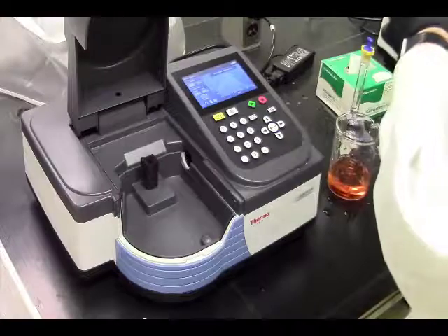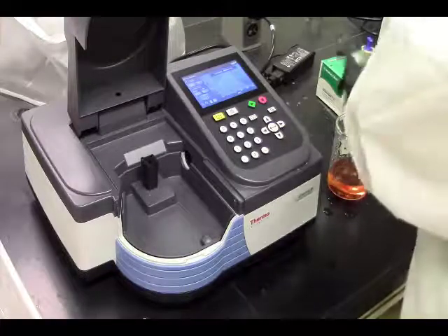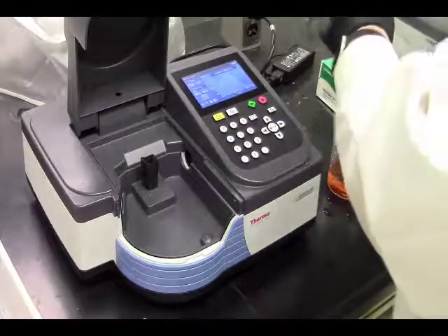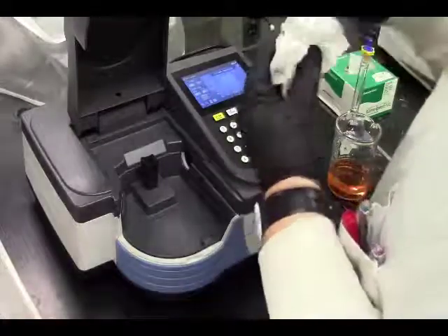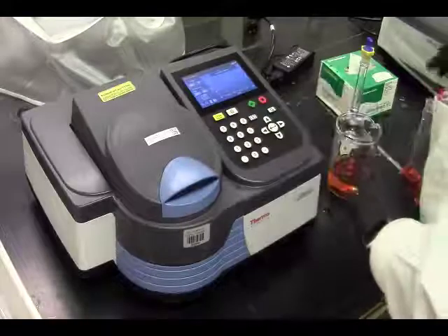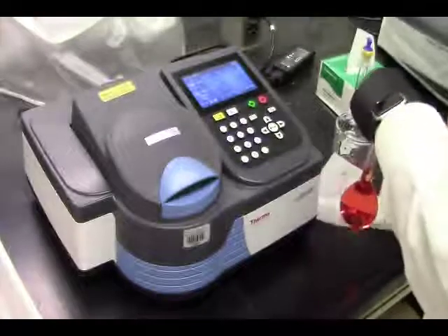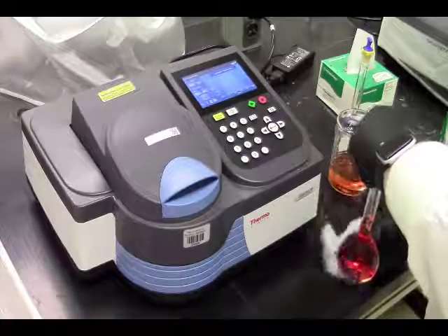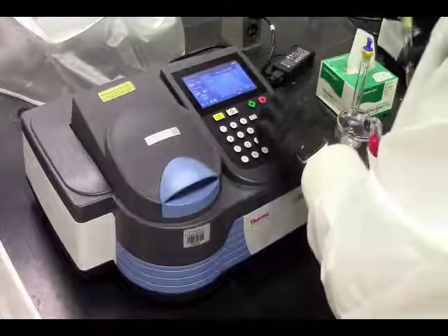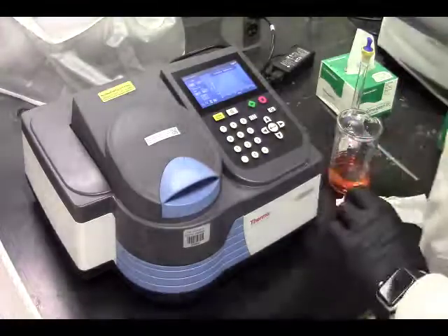Cup running over on that one. Sure, I'll wipe off all that excess I got on there. And this one. This is 25 milliliter. Clean up my mess. Always make sure you clean up your mess. Go to 510. This is 0.521.